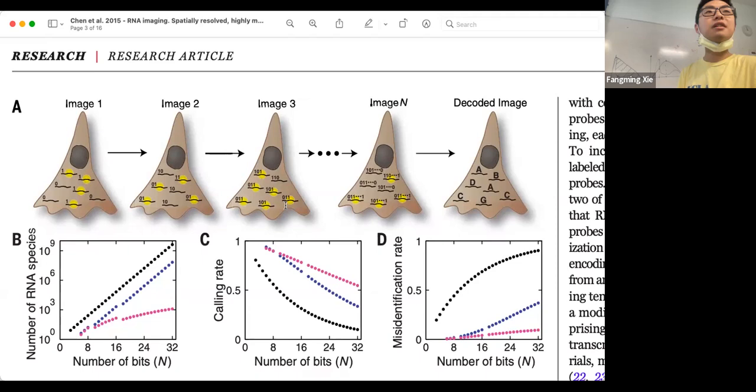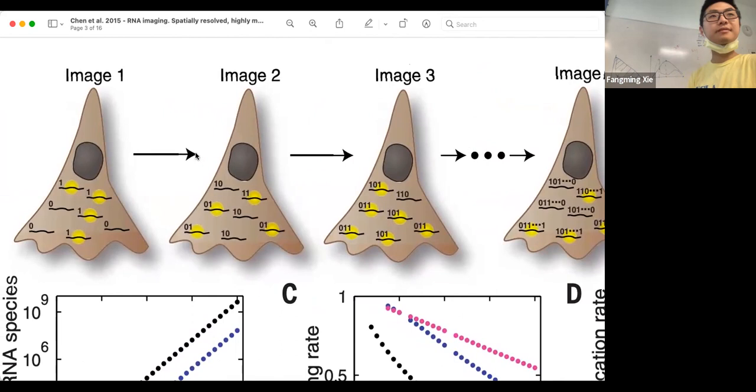You don't need to design new flow. Yeah, good question. You don't need to design new flow, you need to design new probes each time that bind to different sections, different mRNA species. Same flow. If every RNA molecule needs a probe, does that mean they just inject this with like 50,000 probes every time?